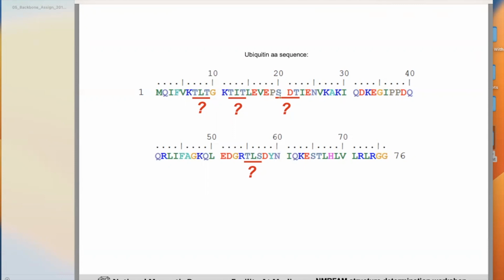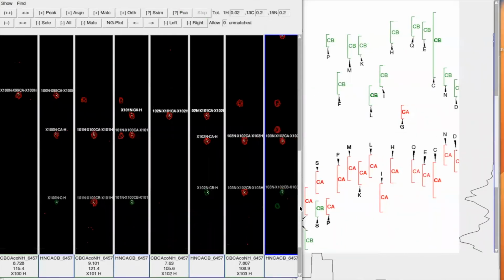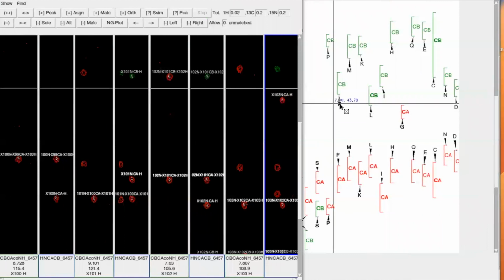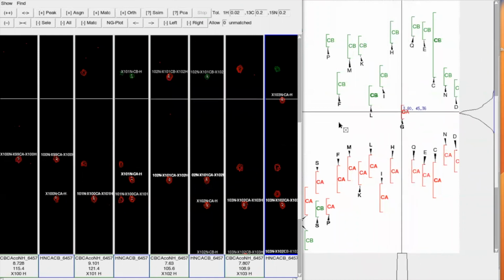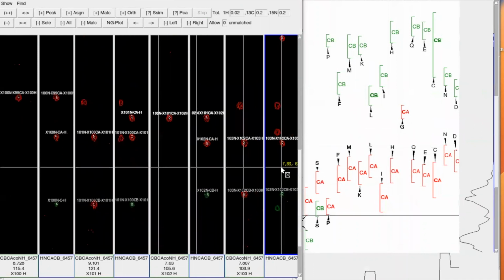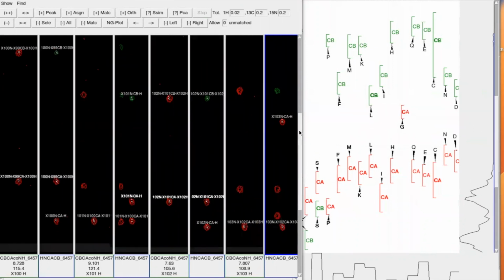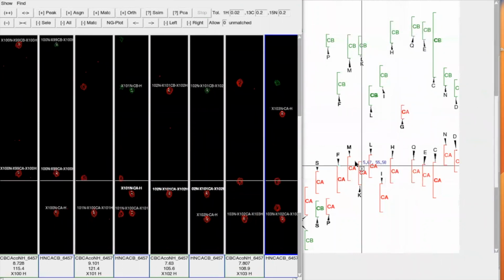So, how do we know which of these 4 places this part of the sequence belongs to? Well, we just have to continue going forward, which is why I found the X103. Here, the X103 carbon alpha is right here. As you can see, this is a much lower carbon alpha chemical shift than the rest of them down here, and it falls perfectly in the glycine. Additionally, as you can see here, there was actually no carbon beta found for this strip for the 103. Which, as I had stated earlier, is one of the properties of glycine. There is no carbon beta shift.